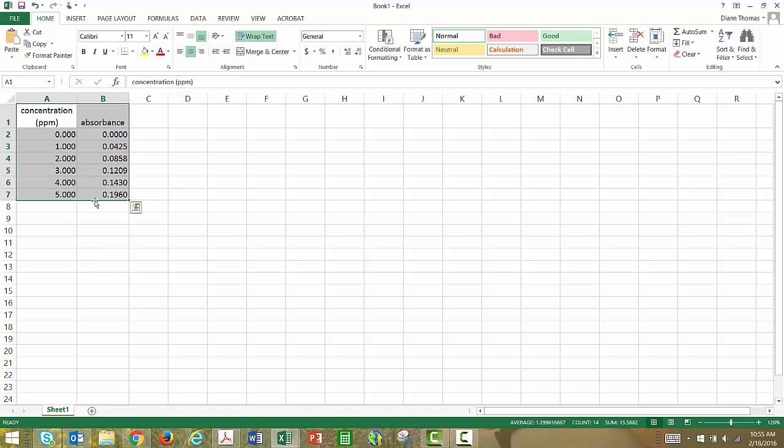You can pick up just the values. So I click and hold and then scroll over those. I'm going to go ahead and pick up the titles here. If this works correctly, what it should do is put those in already as part of the legend as my relationships there, as my axes.